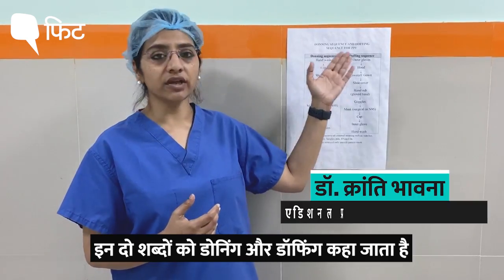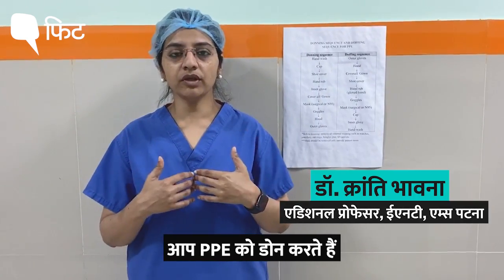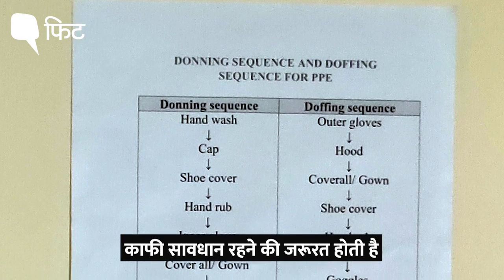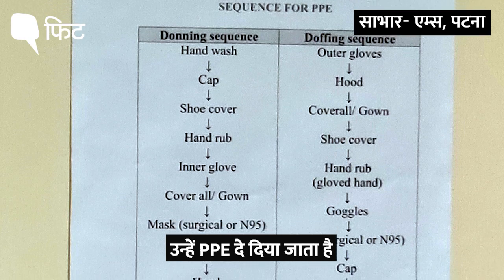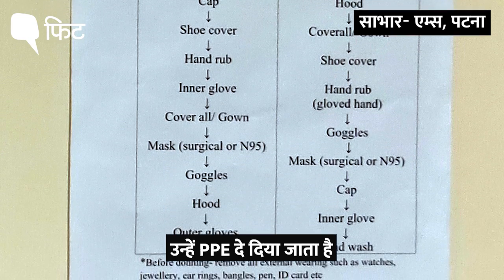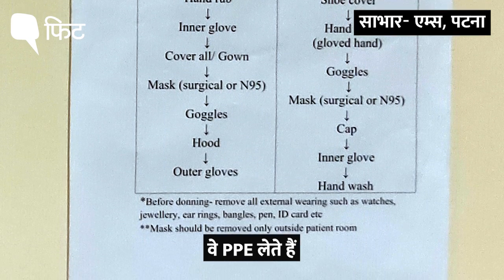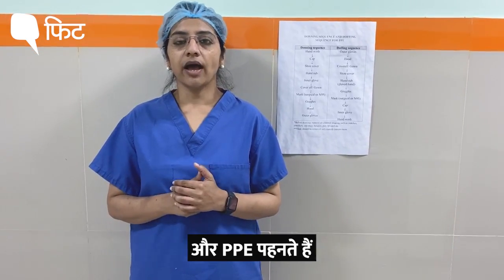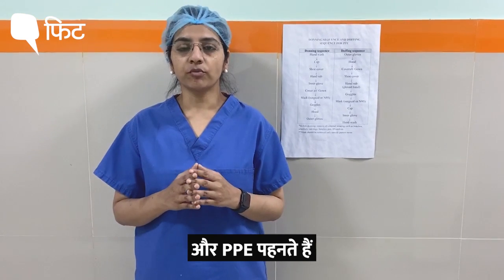These two terms — donning and doffing — refer to how you put on and take off the PPE. It is here that healthcare workers need to be very careful. Once they are issued a PPE kit, which has to be rationed, they take it and through a dedicated lift go to the area of isolation where they change into their proper PPE.